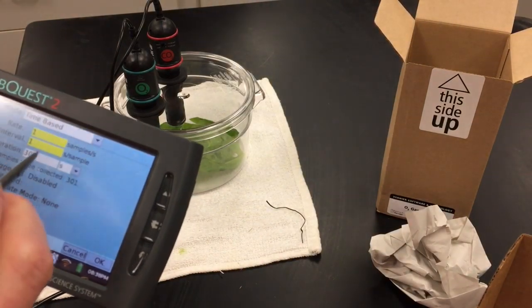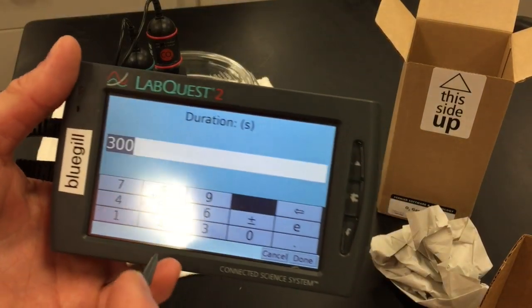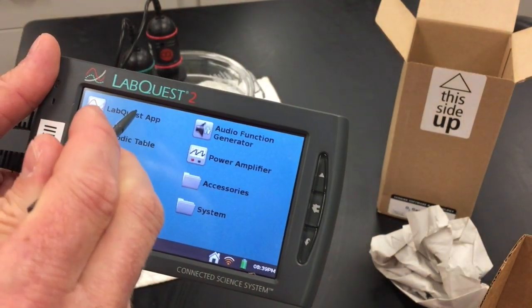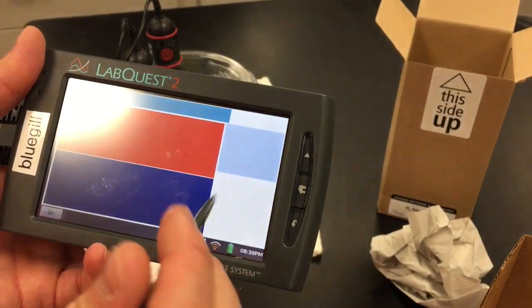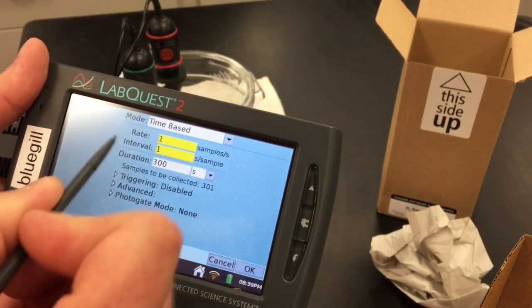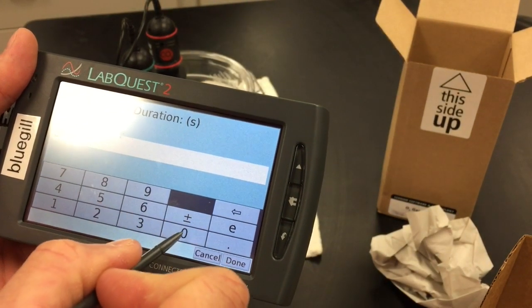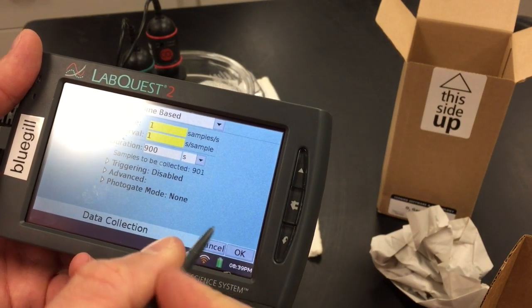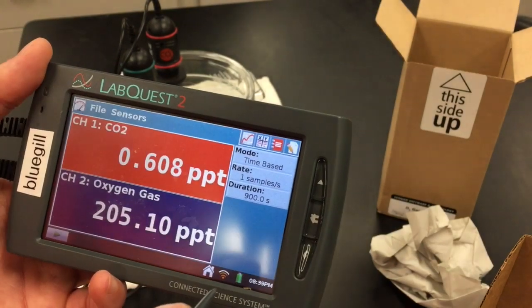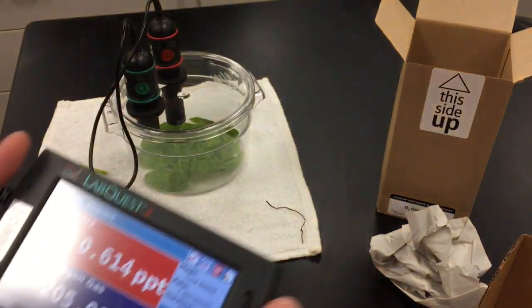Set the experiment to run for 900 seconds. On the LabQuest app, when you're on the meter screen, set the time-based duration to 900 seconds. Now everything is set up.